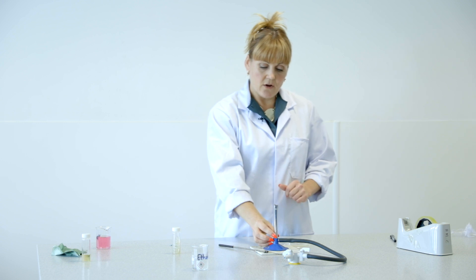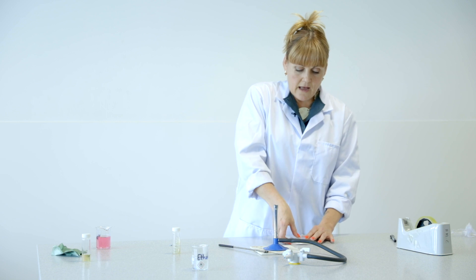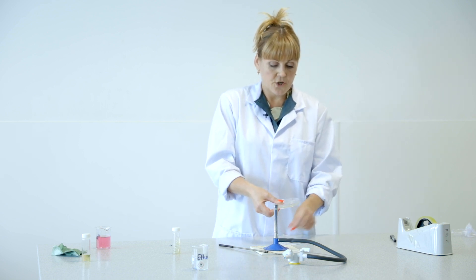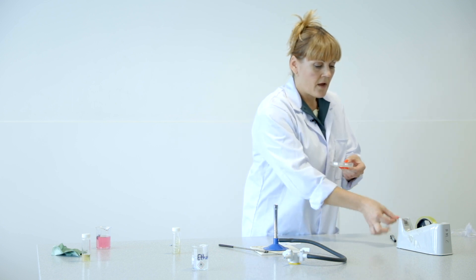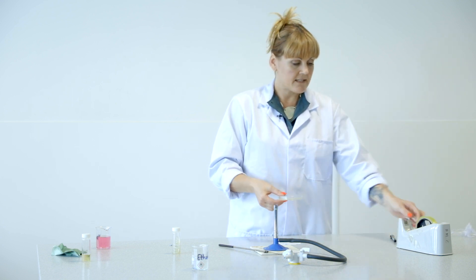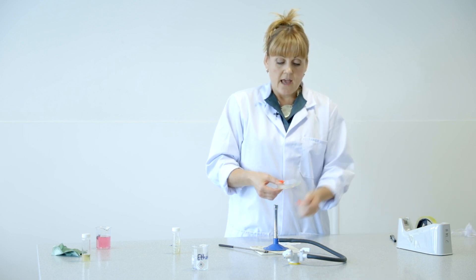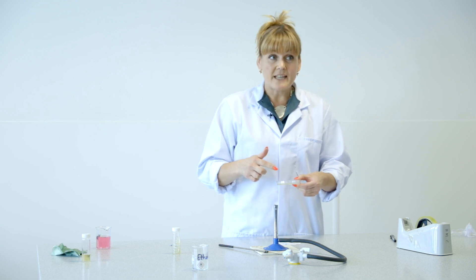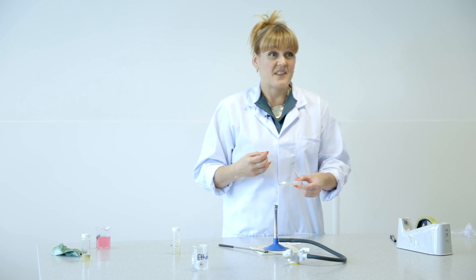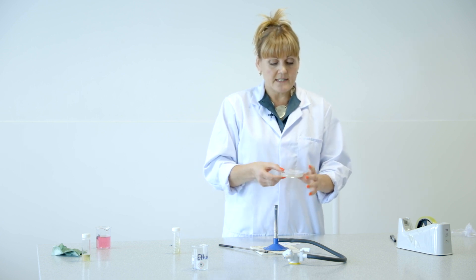I'll turn this back to the safety flame. Now I can remove the stencil and secure the lid with sellotape. Remember, you only put two small pieces of sellotape on the Petri dish to secure the lid. If you wrap sellotape all the way around it, you risk culturing pathogenic anaerobic bacteria, which we don't want. So that is the streak plate complete.